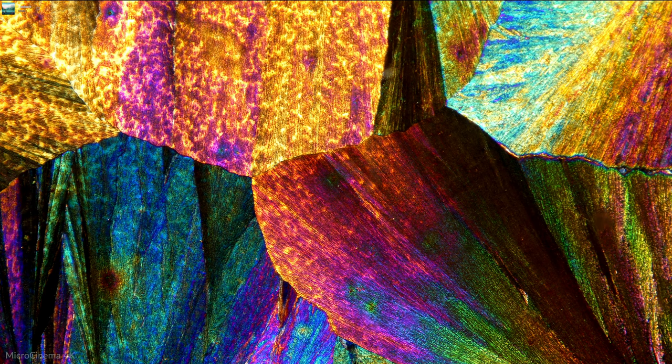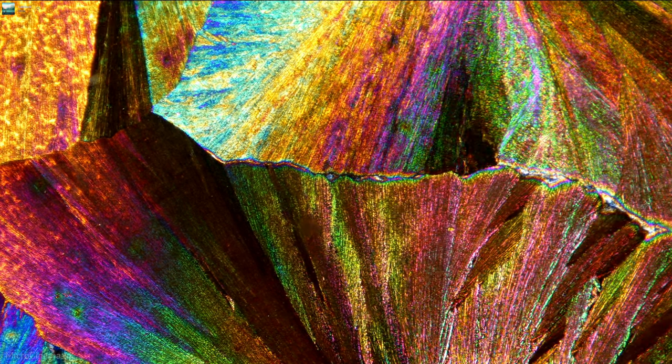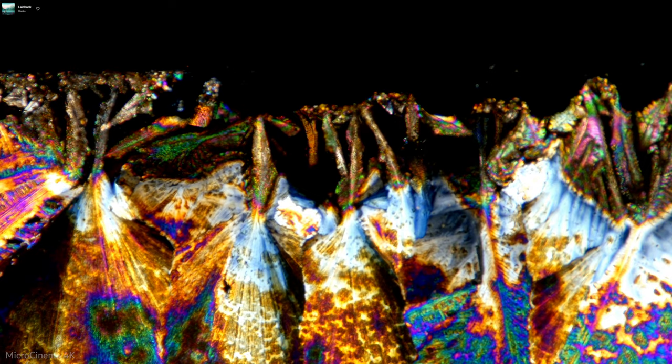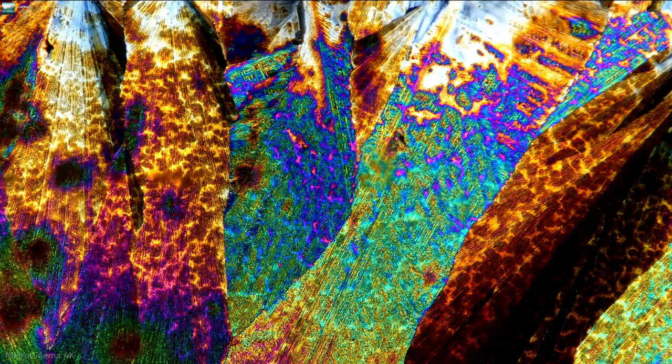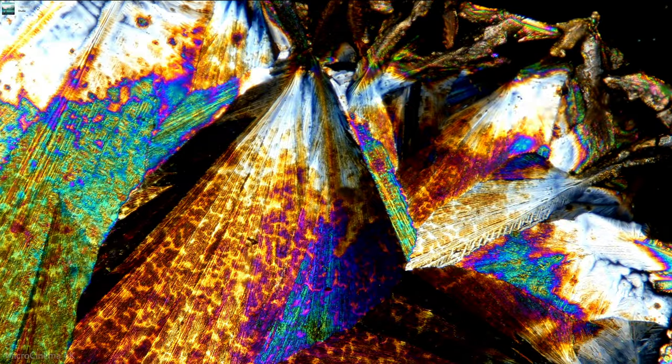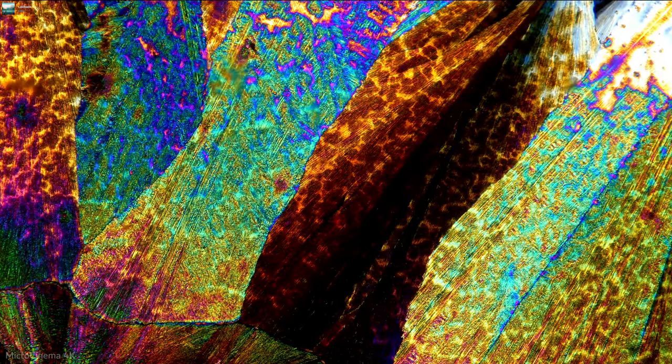And that pre-encodes a wavelength dependence on the light. And then when the specimen does its normal thing on it, we see that as a wavelength dependence in the specimen. With these crystals here, the crystals themselves are basically acting like the wave plates and are causing these very fun colors.